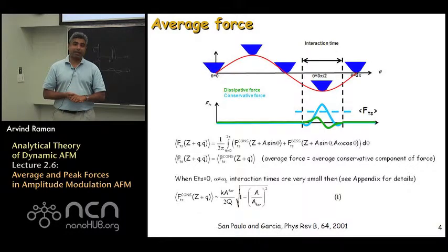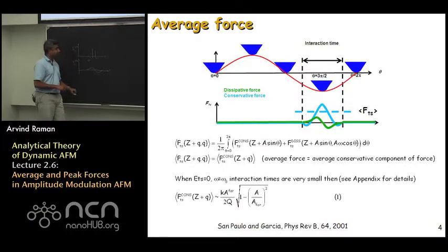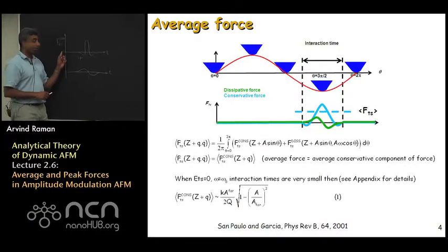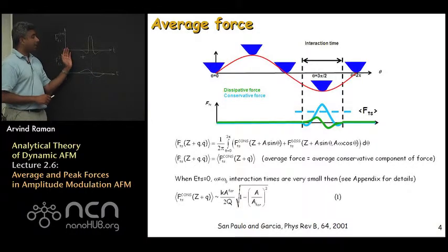So we're going to talk about the average force. And let me go over to the board and try to walk you through a couple of key steps in the derivation. Like I mentioned to you, what I've plotted out here is the conservative tip sample interaction force as a function of time. This is the dissipative component as a function of time.